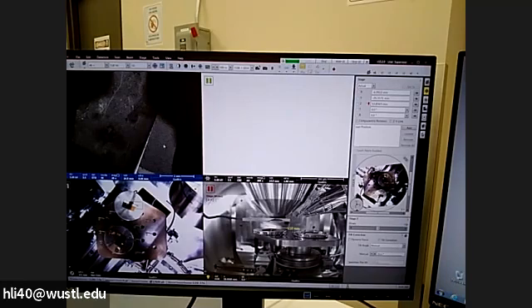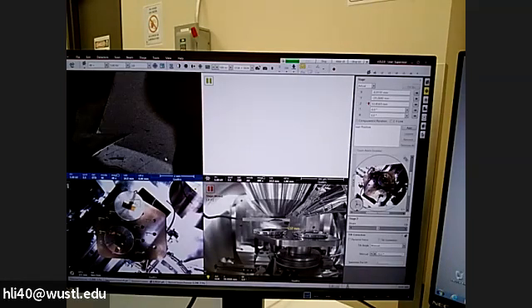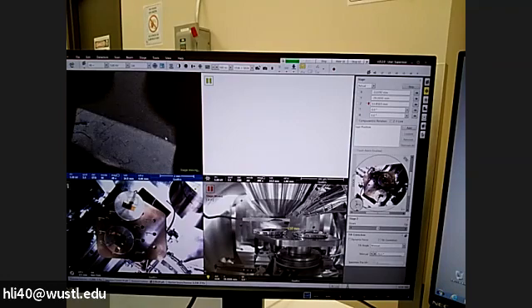So I show you two ways. One is a double click. You will move to center. Another one is holding the wheel and move the mouse to the direction you're going. Okay. So now we find the area of interest. Okay, I'm interested on this particle side, not this blank side. So I just work on the interface. Okay, so I double click on this interface.